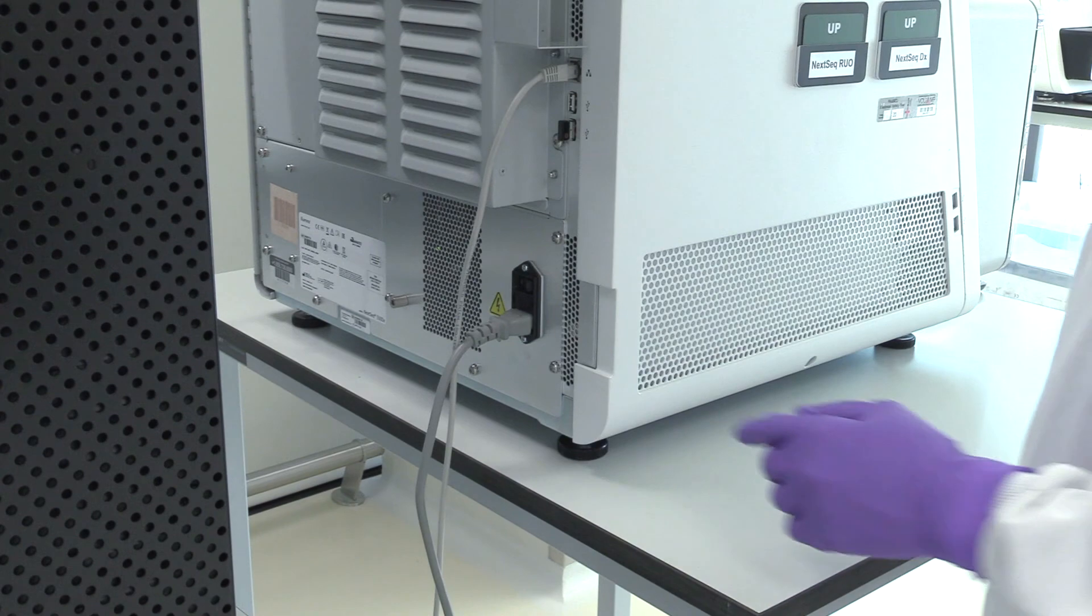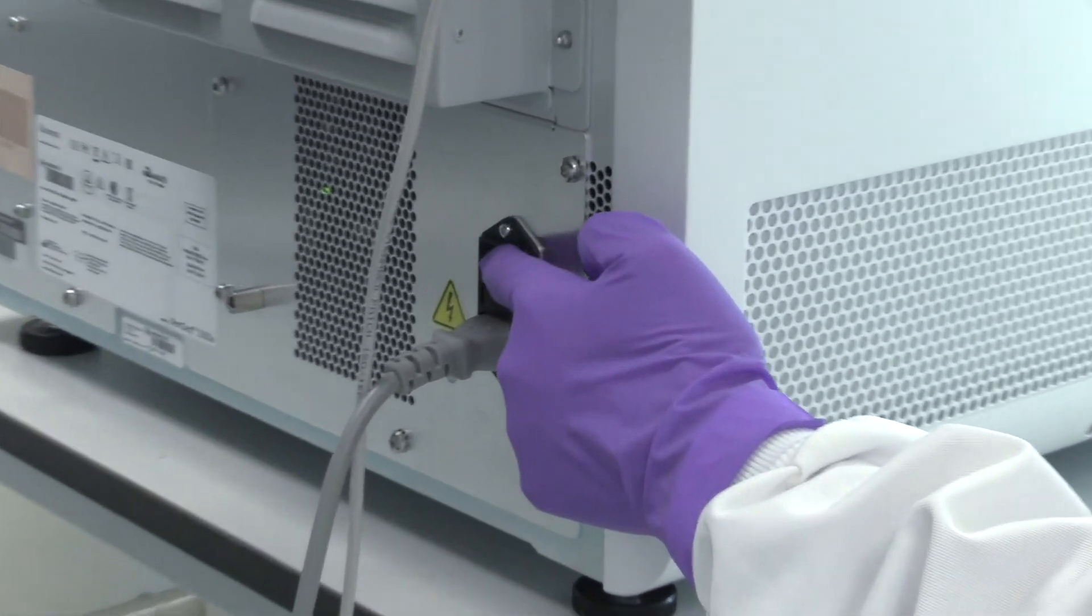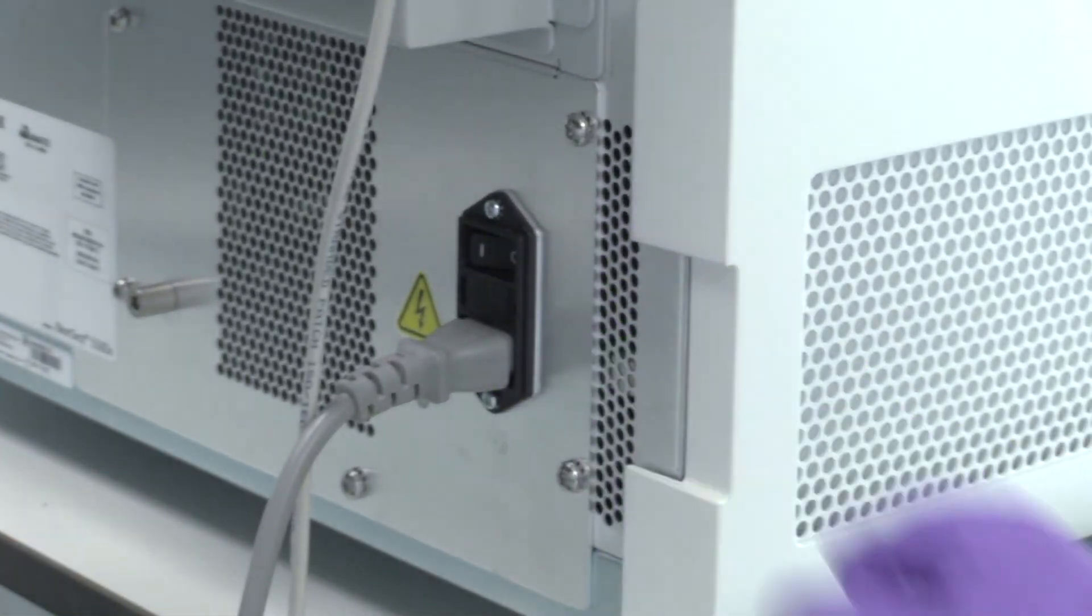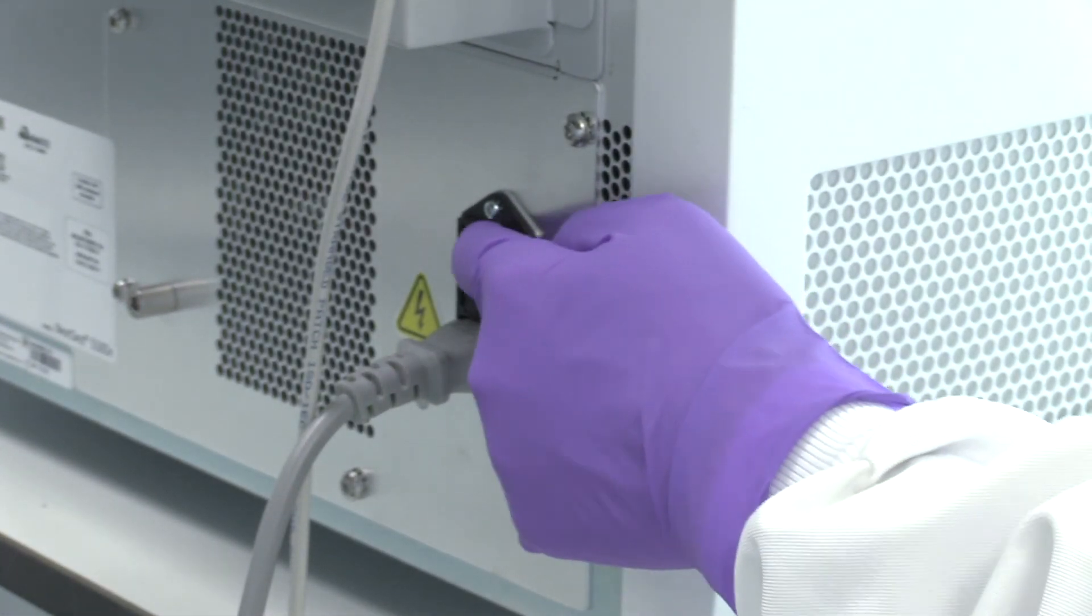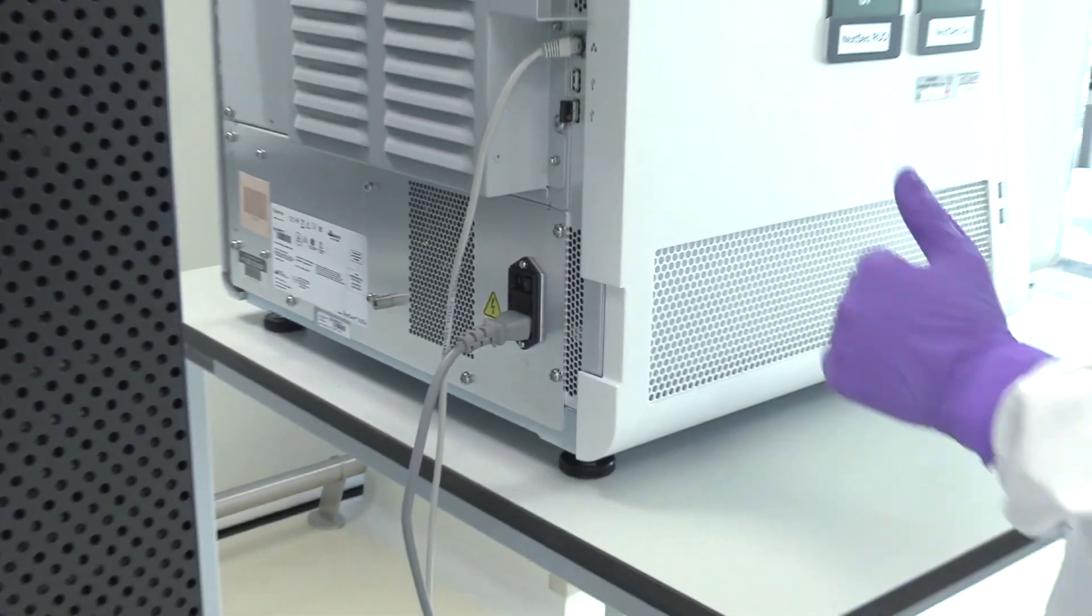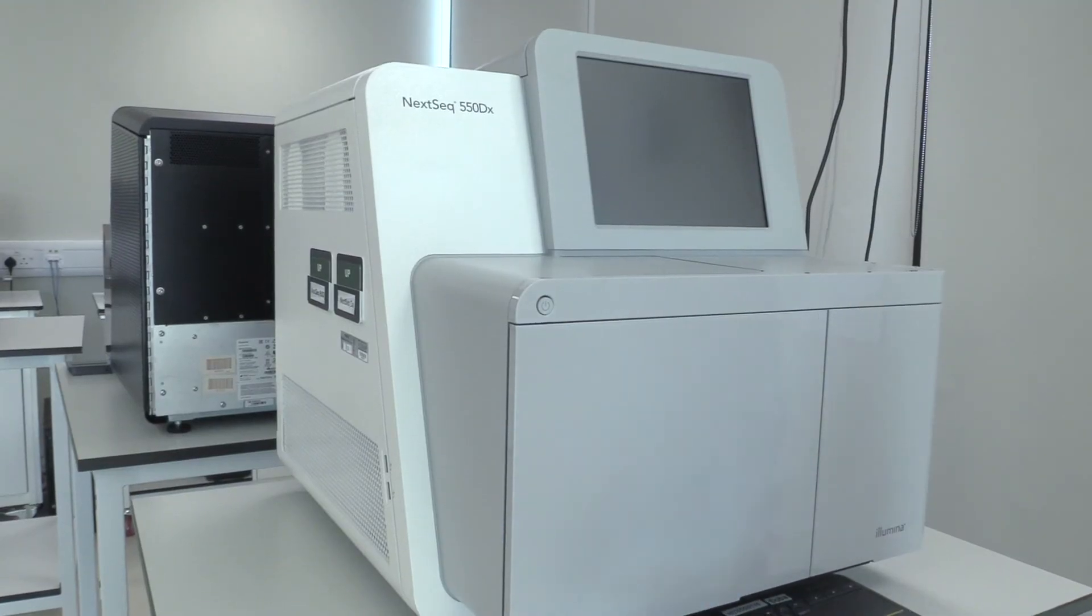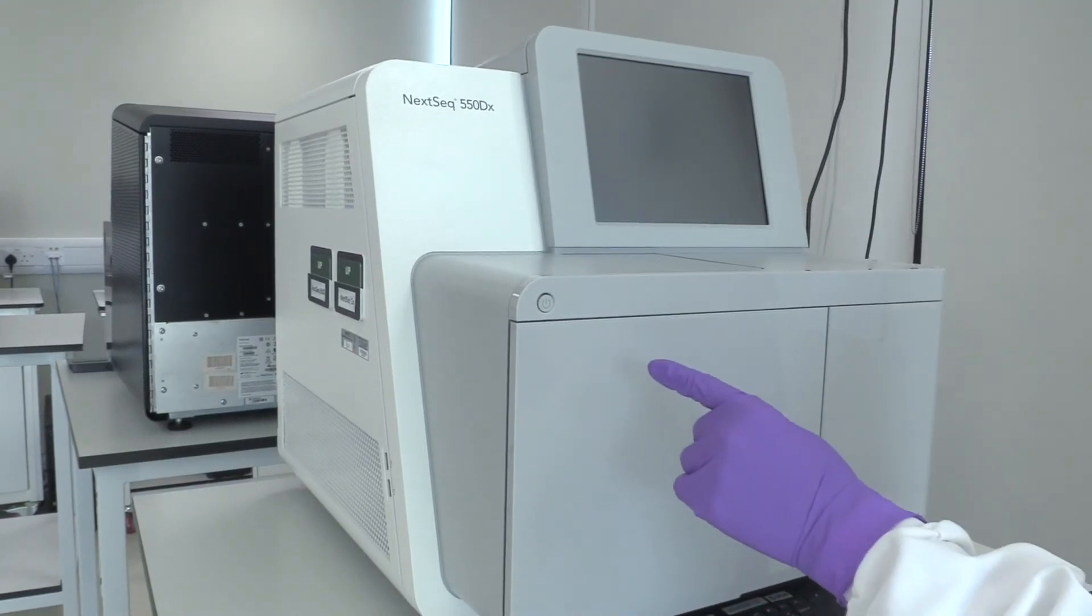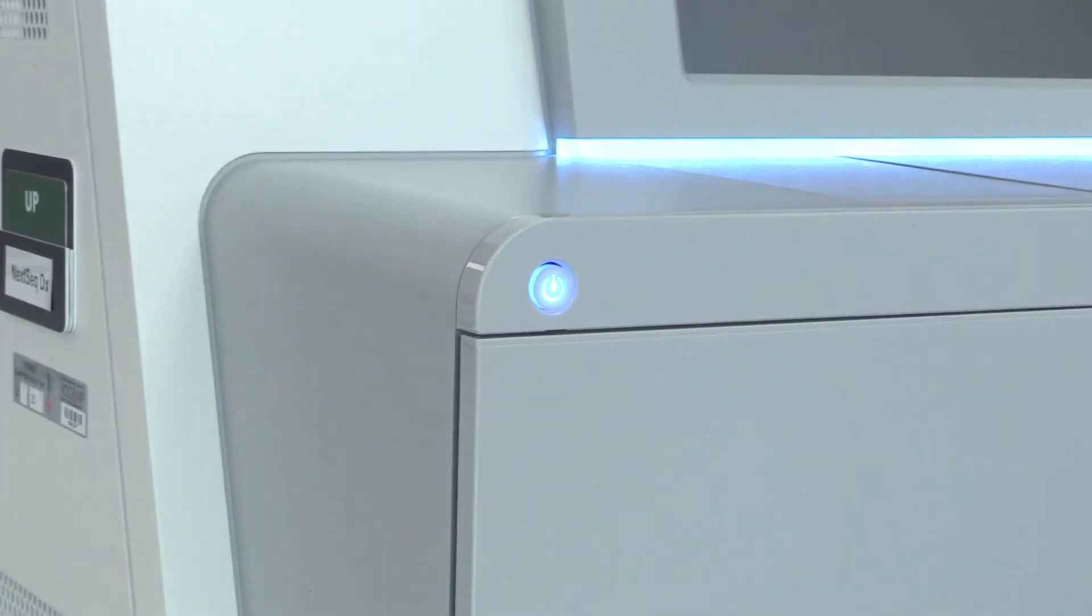Once the instrument shows a black screen, please switch off the instrument by the switch at the back of the instrument. After waiting briefly, switch the instrument back on by pushing the button on the front panel of the NexSeq 500-550DX.